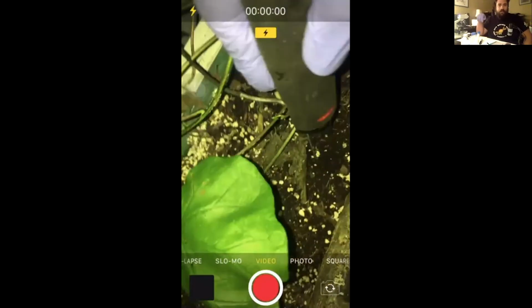Anyway, I'm going in there. I inoculated the soil with some fungi earlier, some garden giants, Stropharia rugosa-annulata. They're great for your garden. They form a symbiosis with bacteria. So we've got a nice little sample we can take a look at. There I am liberating the soil sample.